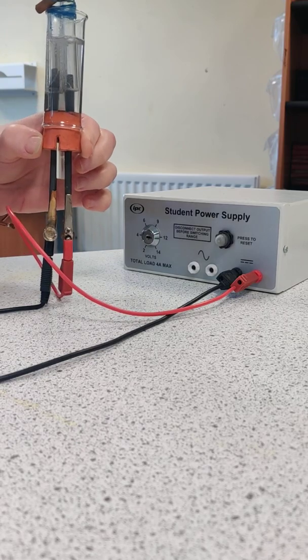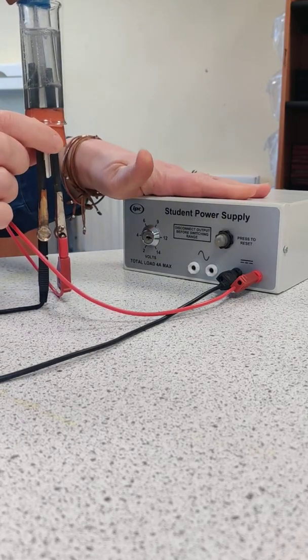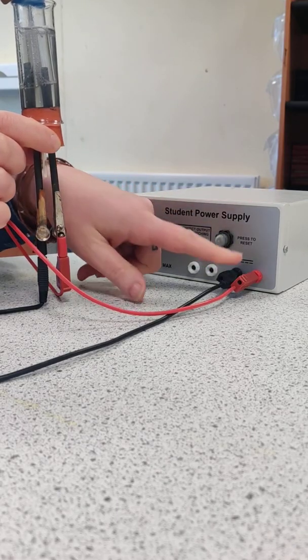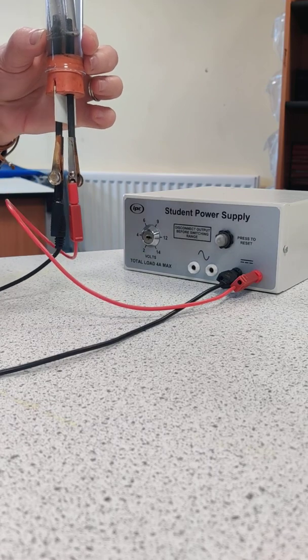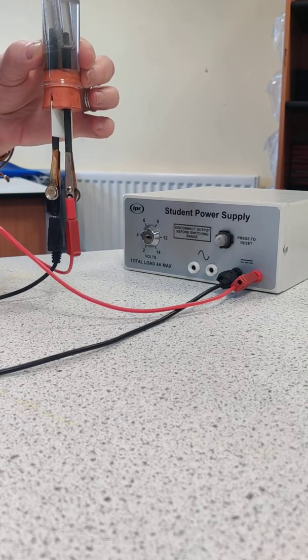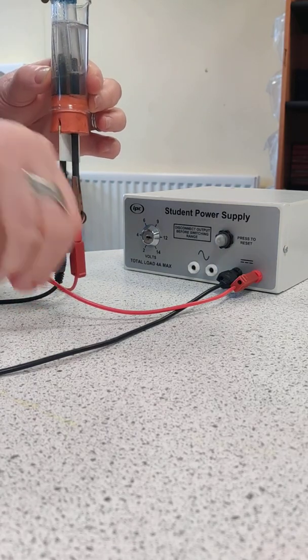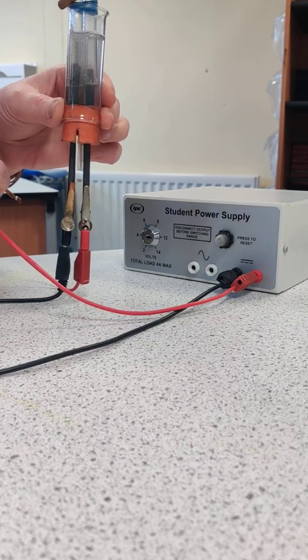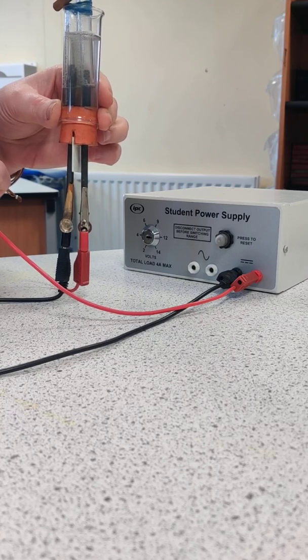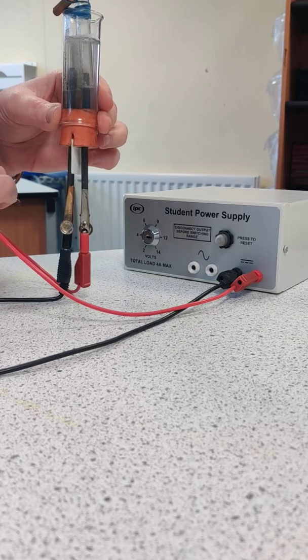But there you can see the setup for electrolysis: a power pack with DC current, two wires connected to two electrodes — a positive and a negative electrode — and they are submerged into a solution which contains a compound that is going to be separated. And that's electrolysis.